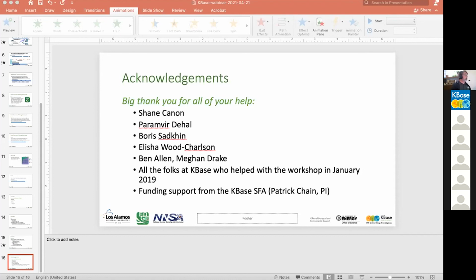Excellent. I'm seeing a few folks sending me questions directly. If you could drop those in the Q&A document. One of them is paired end versus single end: you can use single end or paired end libraries. Thank you for reminding me.